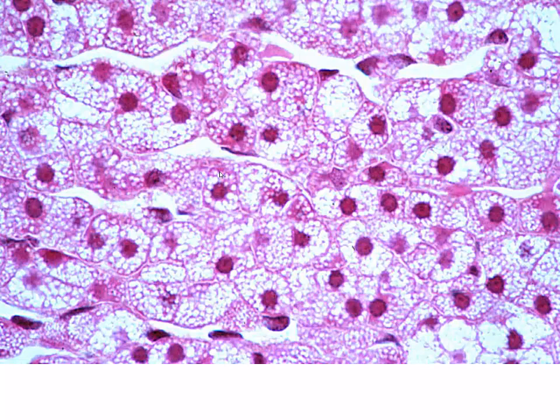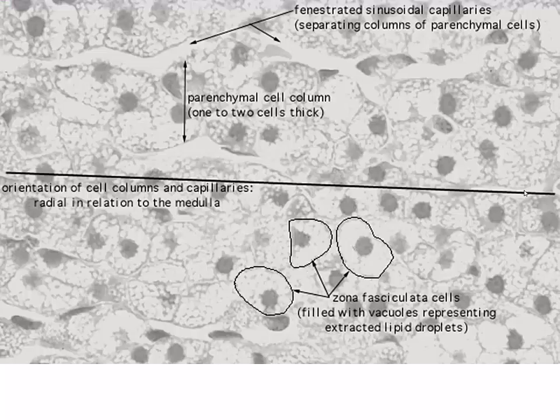But again, typically in the human body, we're not going to see that vast percentage of brown fat. Also, you can see these somewhat sinusoids running through and how these are arranged in plates or columns. Again, that's very characteristic of what we see in the zona fasciculata. So putting all of those things together, the rarity of the multilocular adipose tissue, the arrangement in columns of this tissue, your sort of differential diagnosis for this histologically would just naturally be looking at the zona fasciculata and the spongiocytes.